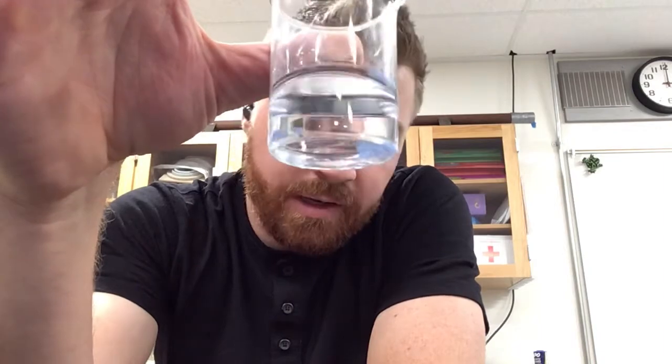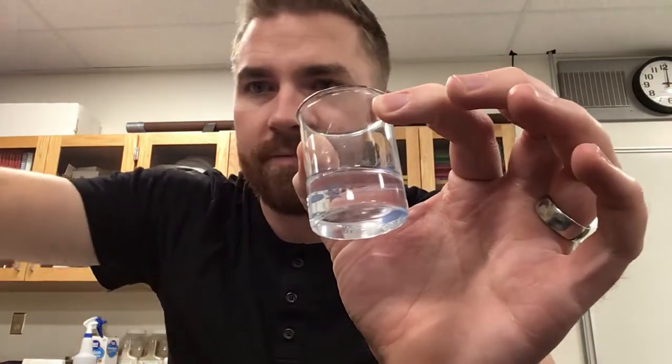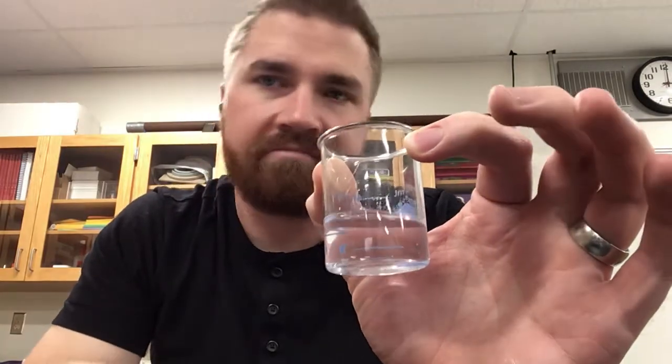Hey guys, so this video is to help you with the lesson Ice Lab if you were not here in class today. Okay, so it's a very simple experiment. Right here I have a beaker with 20 milliliters of a clear solution in it, and we're going to add ice to that solution. Then we're going to observe that solution for a few minutes.